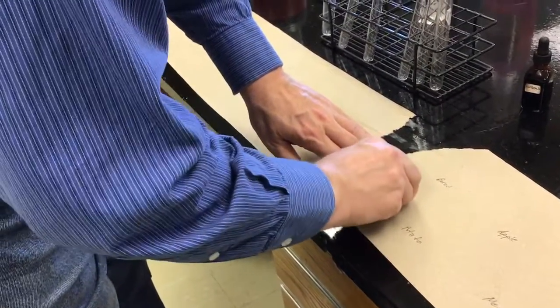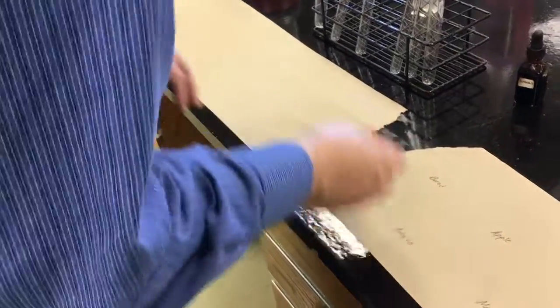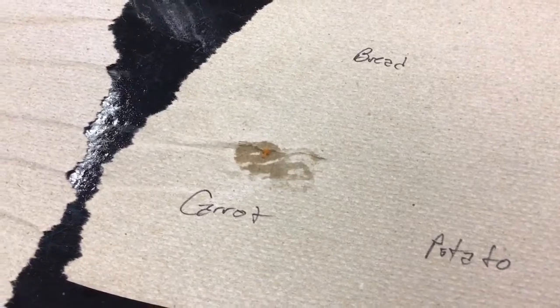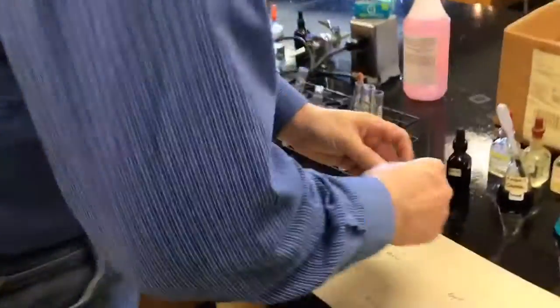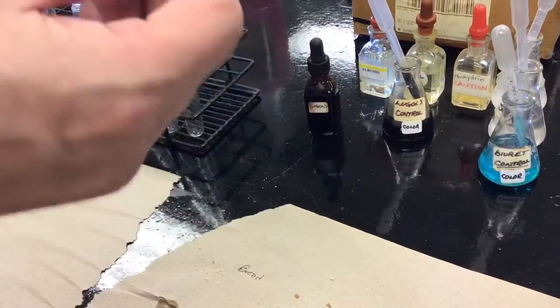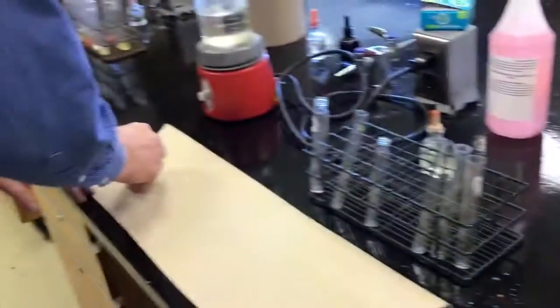There we go. And when that sort of dries, it still looks wet and light will come through it, that's an indication that there's lipids in the carrots. And I was just gonna put the piece of carrot on the other piece of paper. Now here's something that never ever works, but I'm gonna show it to you anyway. The bread. There is no way in the world you can make a wet spot with it. I had one type of Italian bread years ago I could get a sort of a wet spot with, but all it does is crumble. So I'm moving the bread over to the other paper.